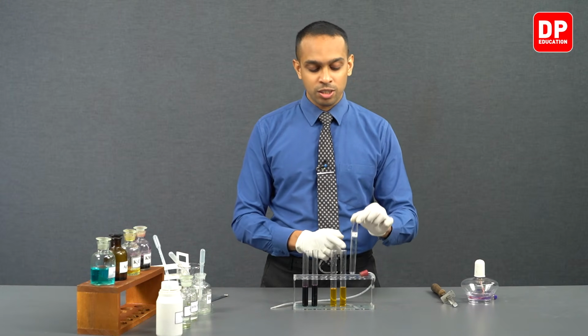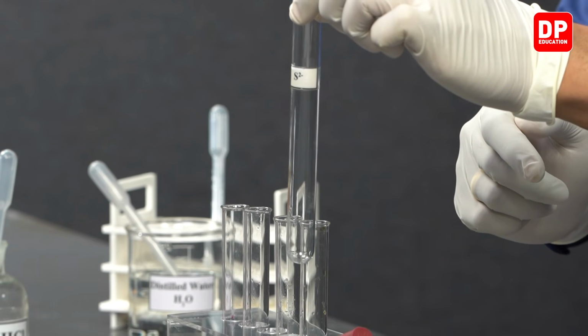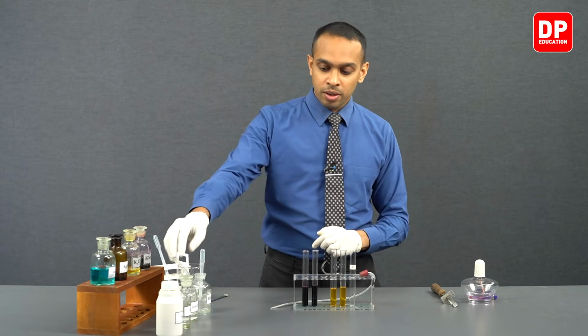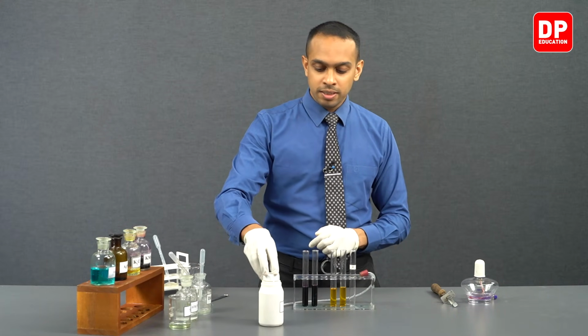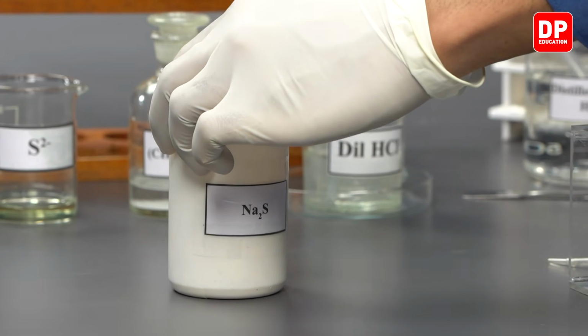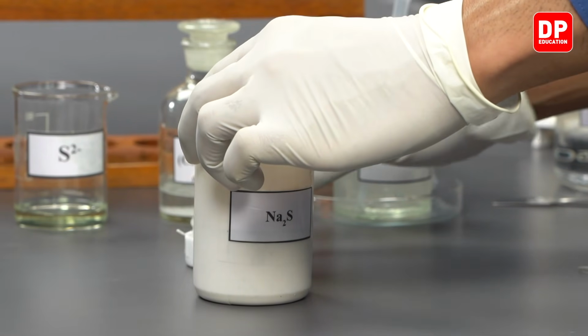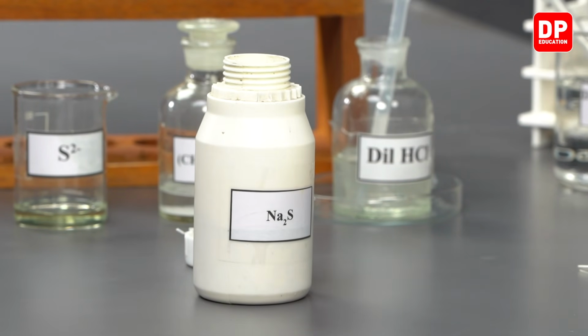So let's first take a small amount of sodium sulfide into this test tube. We have our sodium sulfide here. We will take a small sample of sodium sulfide into our test tube over here.